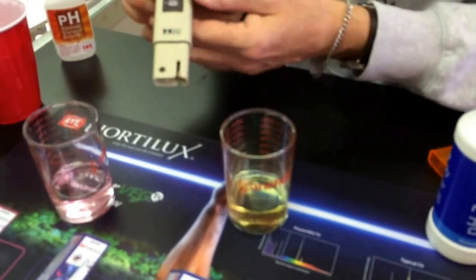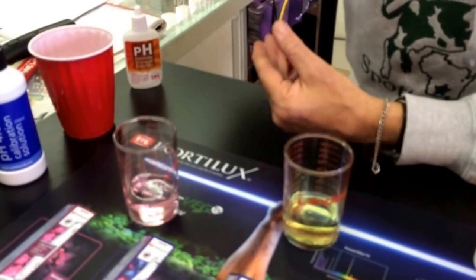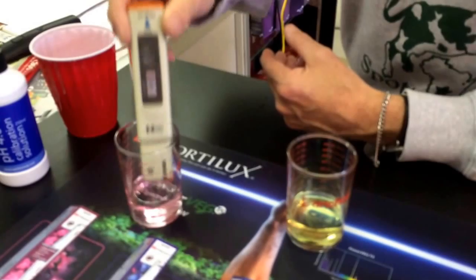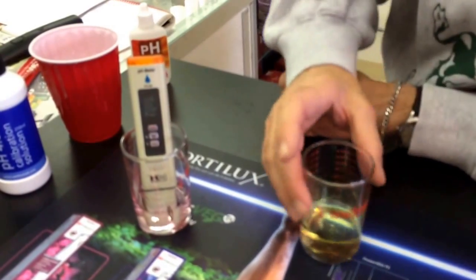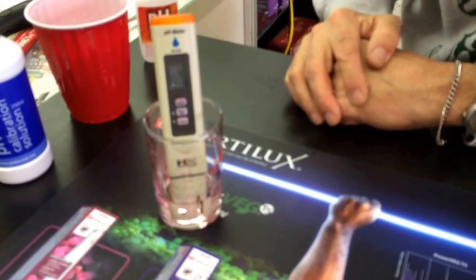If you really want to, you can calibrate it to 4.0 as well. We have the Bluelab pH 4.0 solution. I would maybe even rinse the probe off just a little bit in some tap water, then drop it in the 4.0 and see if it's actually calibrated for 4.0.